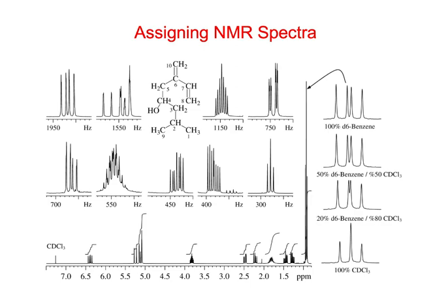So where's the most complicated signal in the whole spectrum? 550 hertz. Yeah, this one right here. Right? So that's one way I think we could assign it like that. So this would be H2. All right? And it's more complicated than we can analyze.